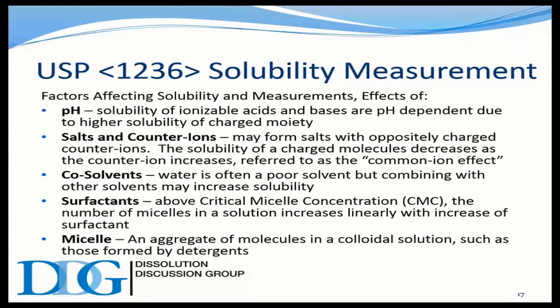Vivian, you want to give that one a shot? Could you repeat the question? That'll help. It's a little bit unclear what they're asking. Of course. So considering this is going to be about particle size, they're asking what if it is nanosized? And then they also say, how do we perform dissolution in an effective manner since there will be a lot of variations in surface tension?